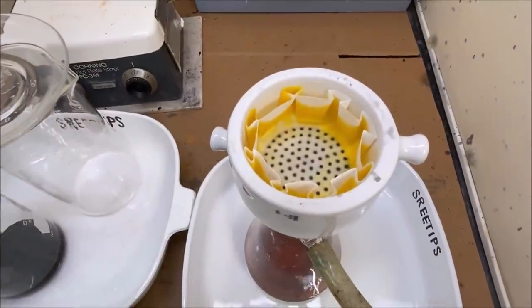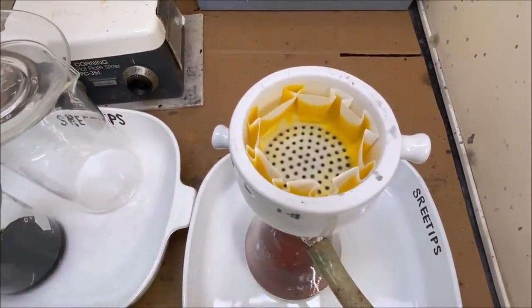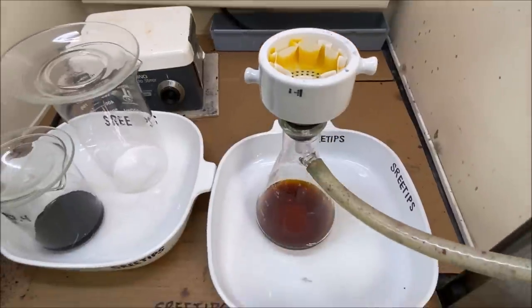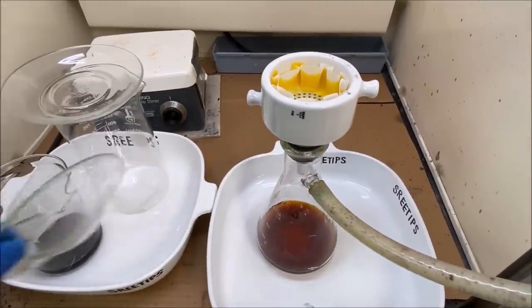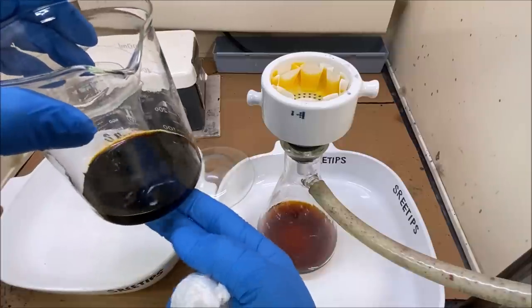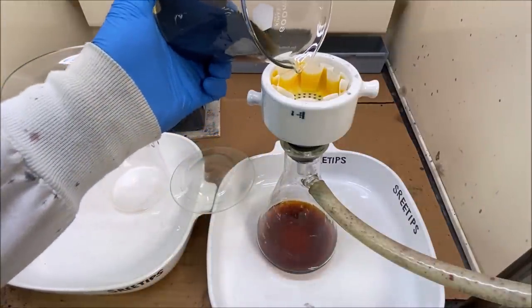That's the junk we were able to filter out of the first beaker that we had poured off. Now what we'll do is we're going to add this one now. This has got considerable more solids in it. It's going to pour right into our filter now.